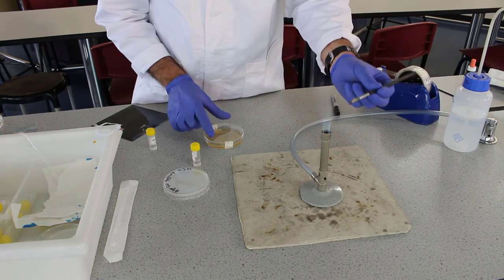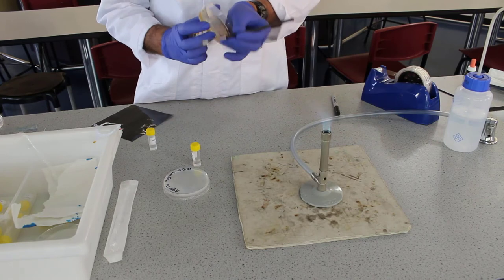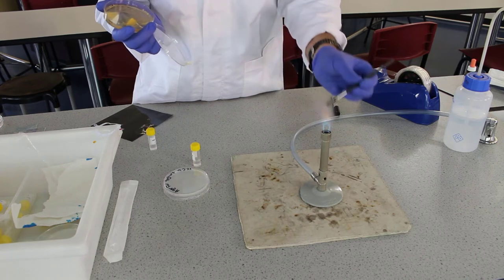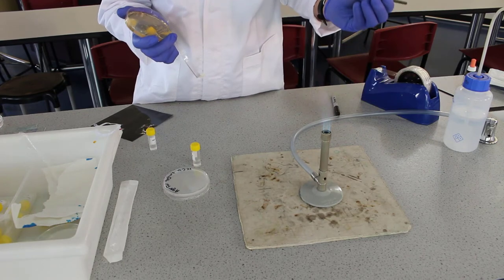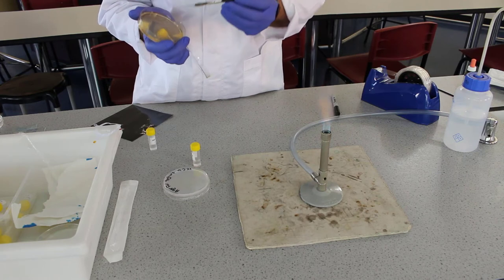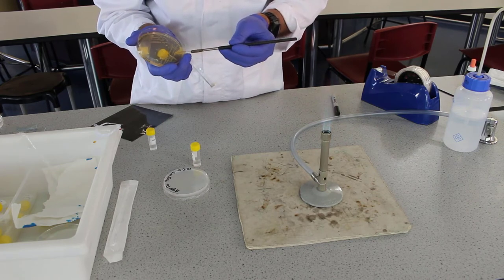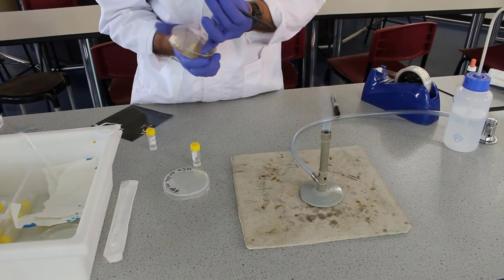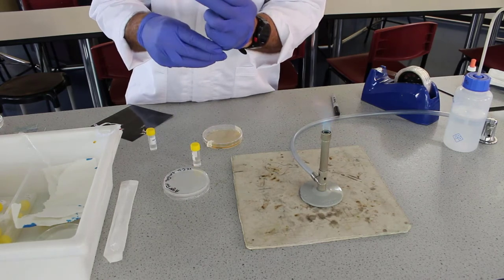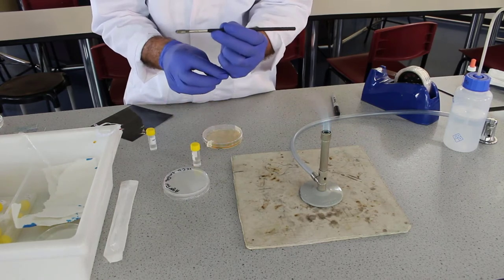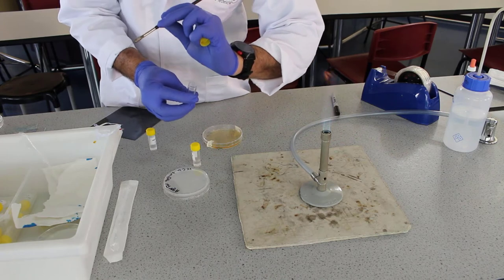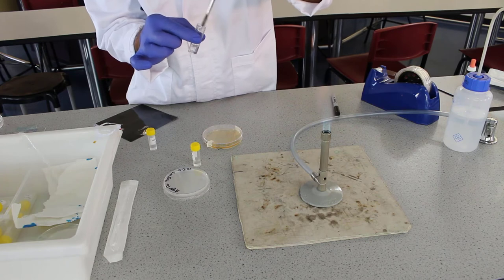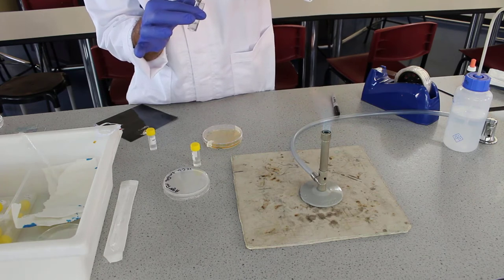Flame our loop and we're going to take some single colonies from our master plate. Flame the loop again. Take some single colonies from our master plate. Not very much. Now I'm going to use my little finger to hold the lid and then we're going to put the loop inside and give it a shake. Shake off that bacteria and it's going to make it a little bit cloudy.